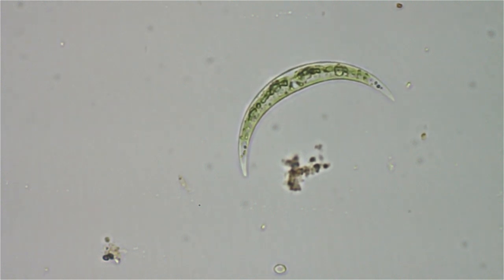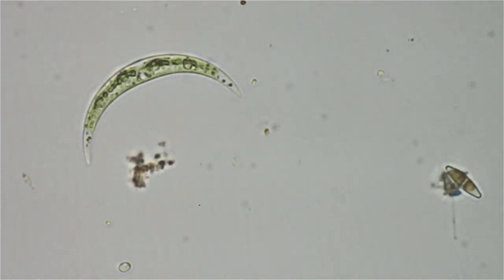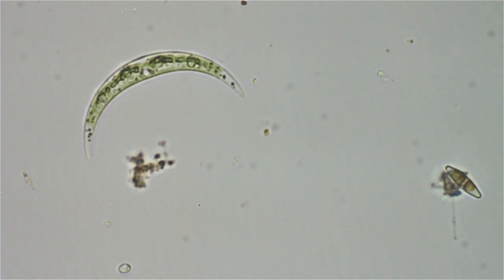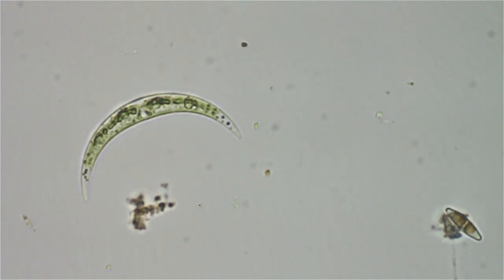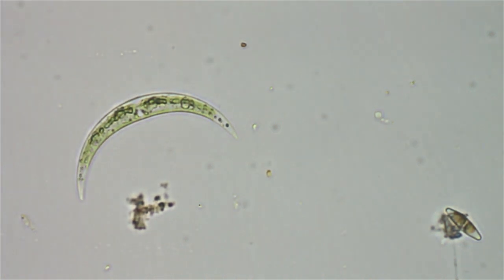He looks like a green sickle moon, doesn't he? I'm using a 40x Nikon Plan Achromat lens here.